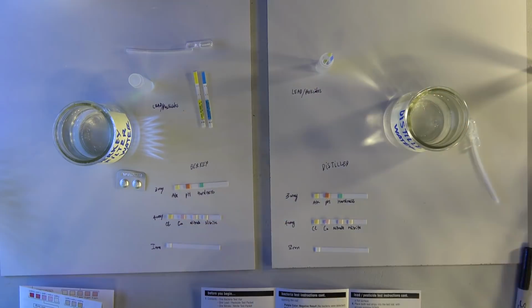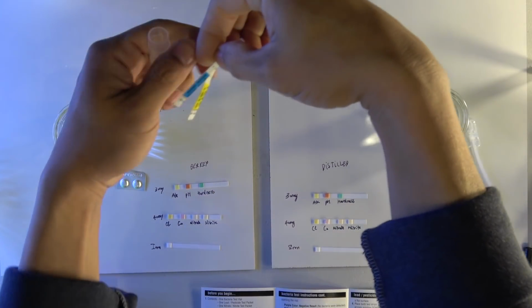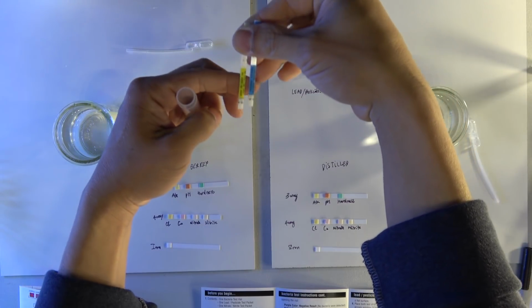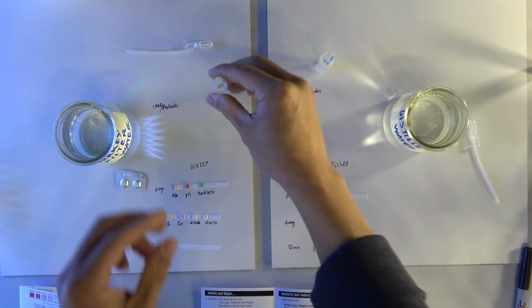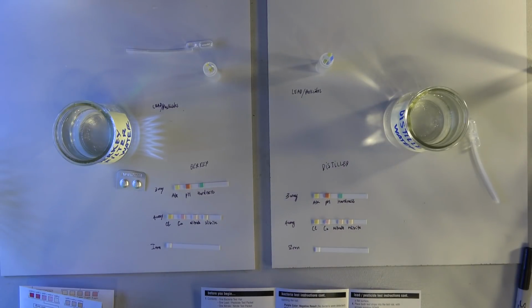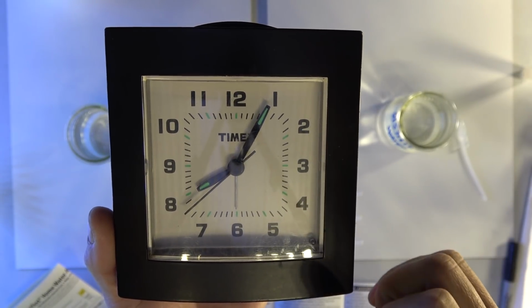Okay, now I'm gonna do the same on the other side. Put both test strips with the arrow side down in the water. Now we have to wait for 10 minutes to get the result. It's about 8:05 right now. We're gonna get the result around say 8:15 or so.